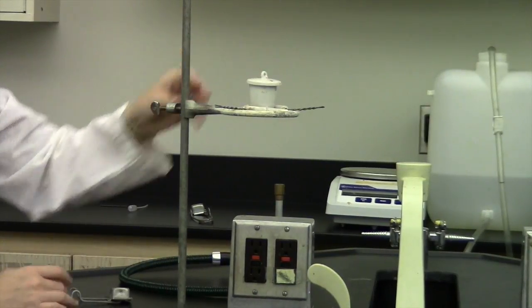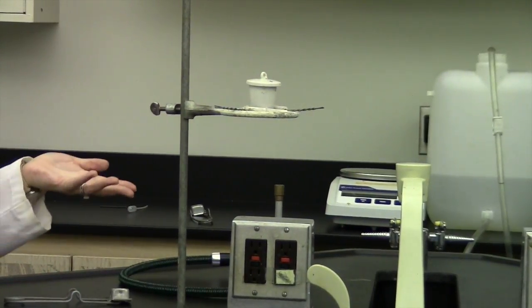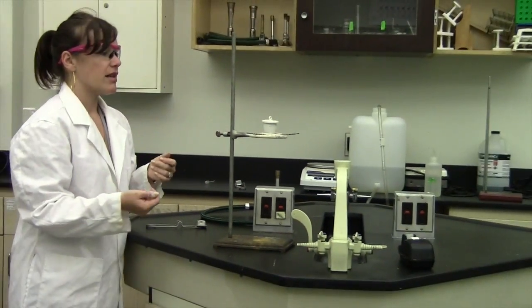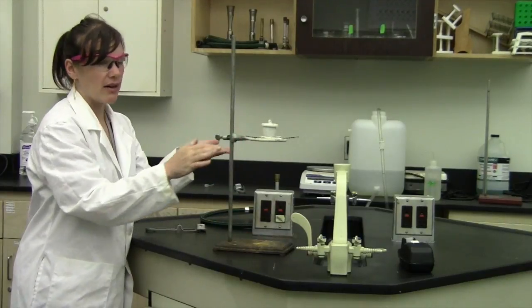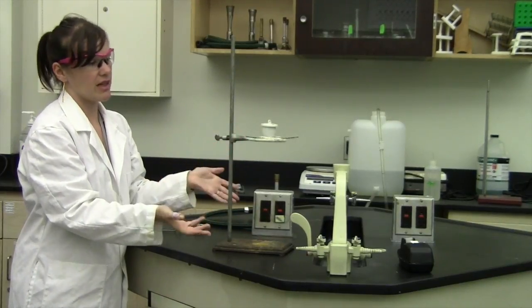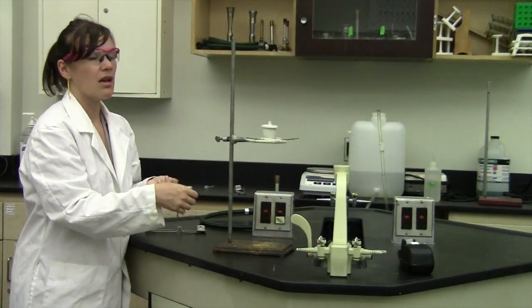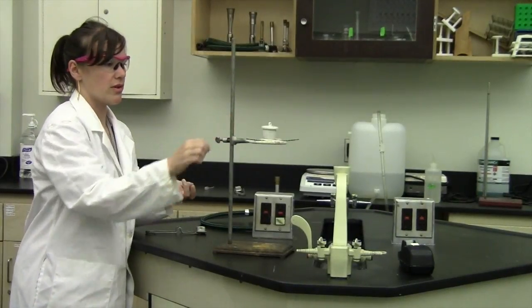Now one item I don't have here but falls into the category of common sense is a pair of tongs because we would have a Bunsen burner here and this would get very hot. So when you're finished, you would use tongs to remove the crucible.